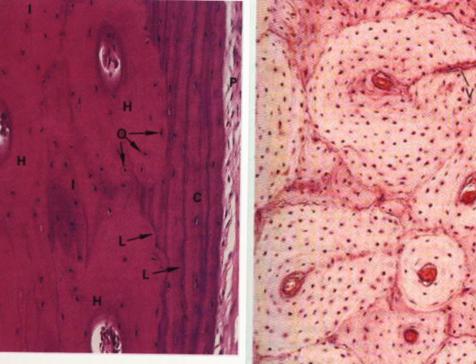If you have a label for these dots, these are osteocytes in lacuna. If you have a label for this area in between the circular Haversian systems or osteon, this area in between is called interstitial lamellae.